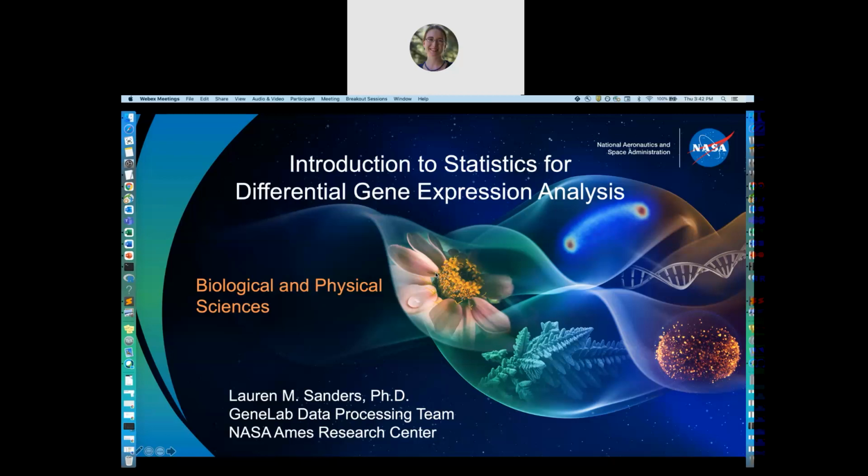But the assumption is that if the gene expression is so low that it sums across all your samples and still ends up being less than 10, which in our case would mean, for example, 10 samples with a gene count of 1 and 2 samples with a gene count of 0, or 9 samples with a gene count of 1 and 3 samples with a gene count of 0, that would get us less than 10. That, to a bioinformatician's eyes, is just noise.